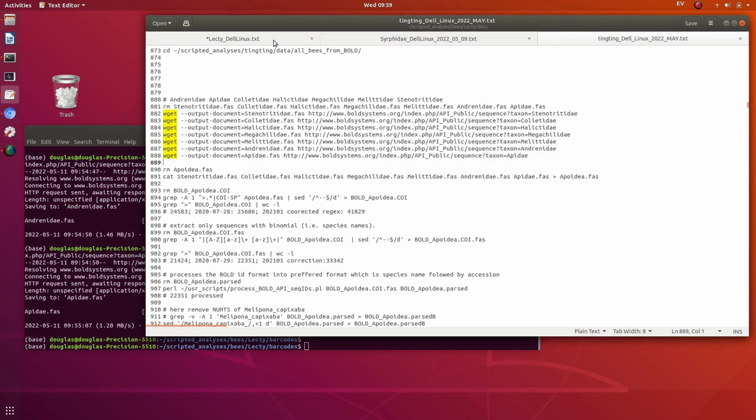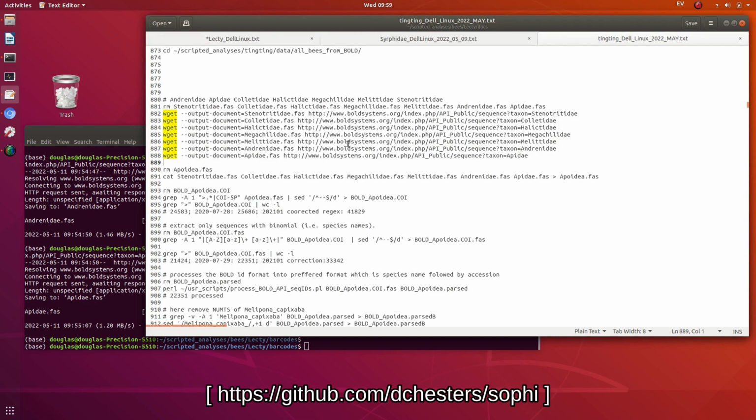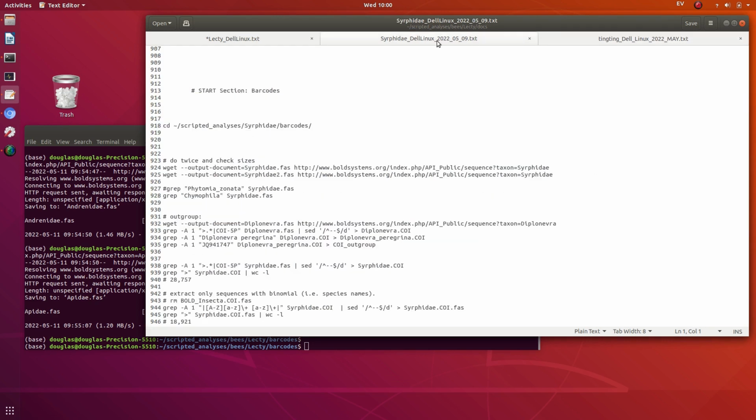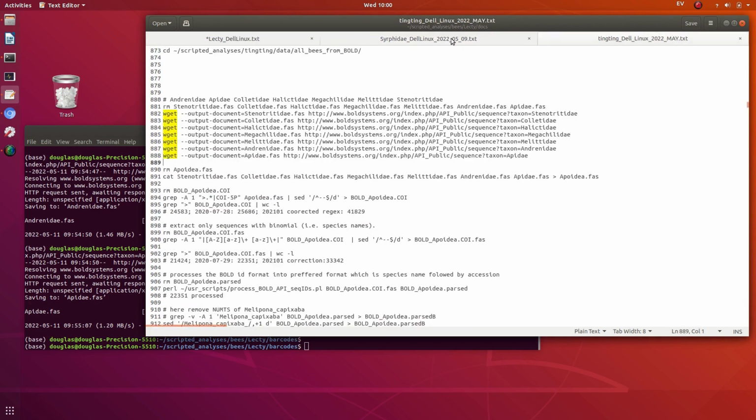So starting a brand new project, obviously already a lot of the framework already to do this. So in practice that means the list of commands from some previous projects. So I have two. This is for bees. This was done maybe 1 or 2 years ago. More recent one, well, not the same taxon, but more recent set of commands. So I'll be consulting. In practice, this just means copying commands over and checking results and modifying accordingly.